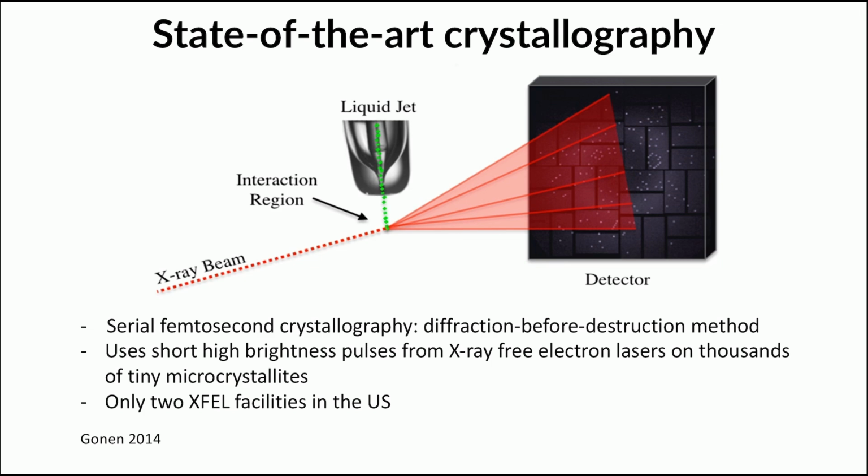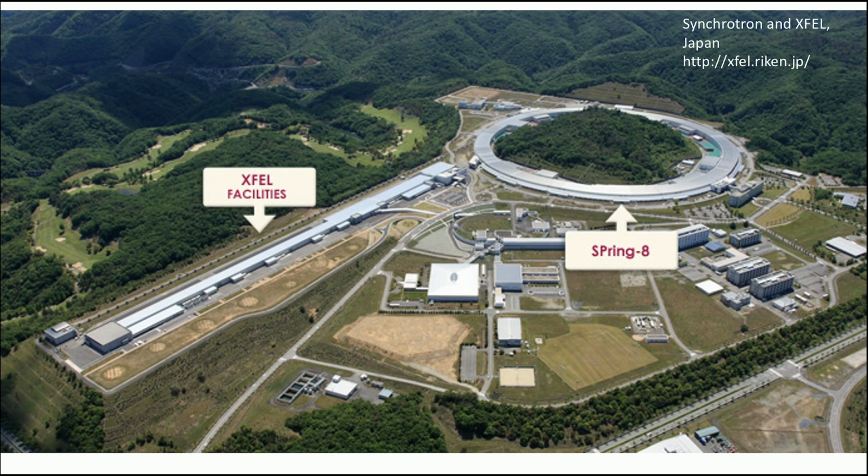But booking XFEL time is incredibly hard because there are only 2 in the US and just 7 in the entire world. This is just in comparison. In Japan, SPring-8 synchrotron is next to the XFEL, very huge, hard to maintain, and expensive to build.